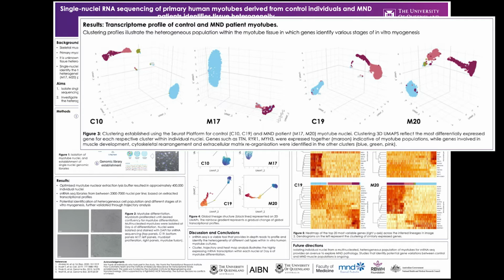The results were visualized through 3D UMAP plots, which gives us a global overview of the variation of the transcriptional profiles. Through expert identification, we consistently found profiles that matched myotube expression, shown in maroon. Genes such as MYO18B, TTN, MYH3, and DMD were found unique to this cluster.